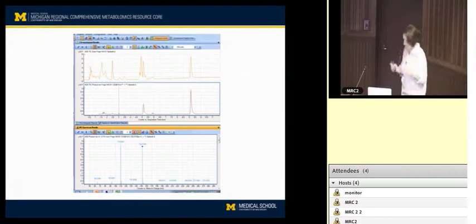But there are situations in which things are only slightly different from each other, an OH group is in a different place, but it's pretty close by, so it doesn't really affect the retention too much. Those things may either coelute or come very close to coeluting. So I'm going to talk a little bit about how we deal with those as well.